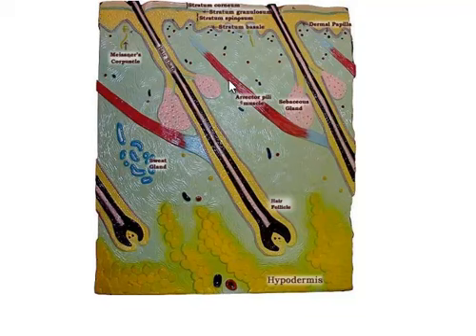There's your erector pili attached to a hair follicle. Here's another hair follicle and another set of sebaceous glands to secrete oil. And then there's your sweat gland that's been sliced. Kind of funny. So hopefully by now when you see that, you go, oh, that's the sweat gland. But it's actually a coiled structure in there.